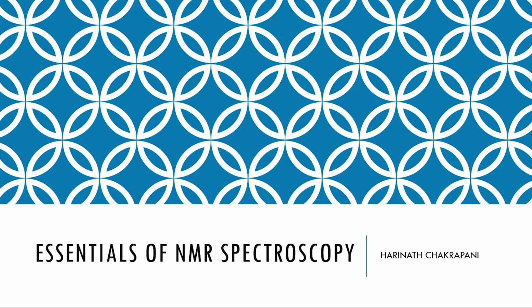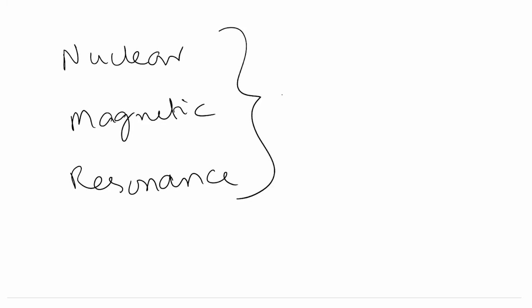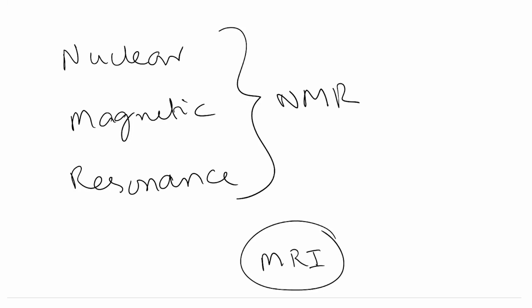So, as the name suggests, NMR stands for nuclear magnetic resonance. If you are familiar with the instrument called magnetic resonance imaging, MRI, maybe some of your family members might have used this. The principle of MRI is very similar to that of NMR.